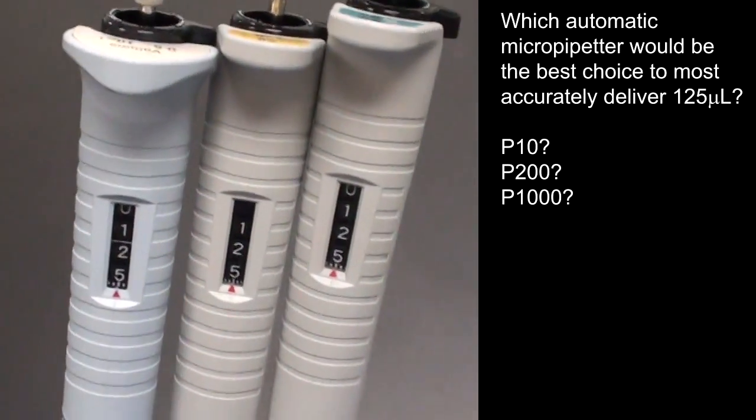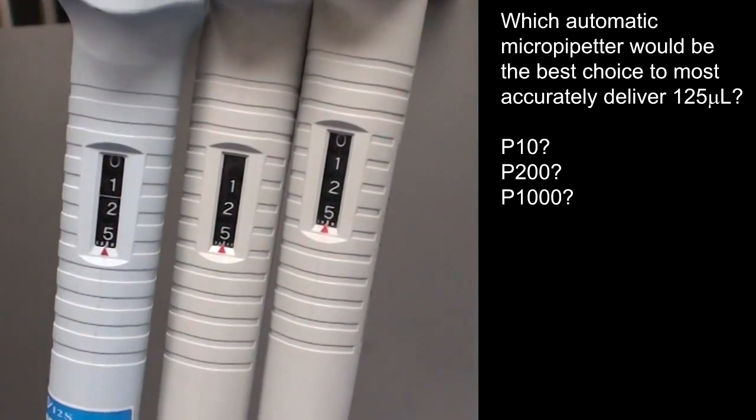Which automatic micropipettor would be the best choice to most accurately deliver 125 microliters?